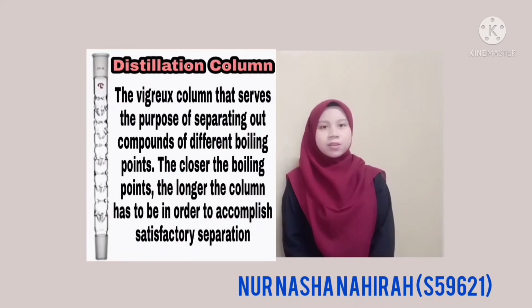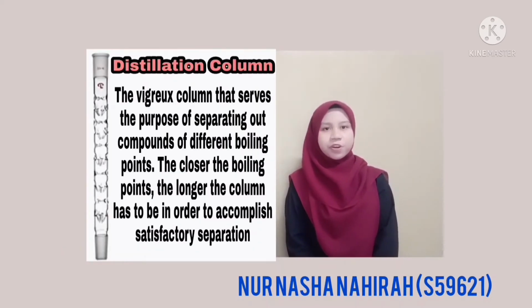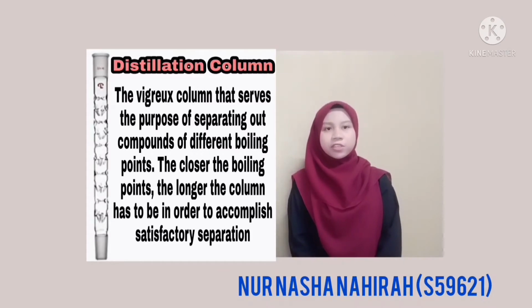Distillation column. The Vigreux column serves the purpose of separating out compounds of different boiling points. The closer the boiling points, the longer the column has to be in order to accomplish satisfactory separation.